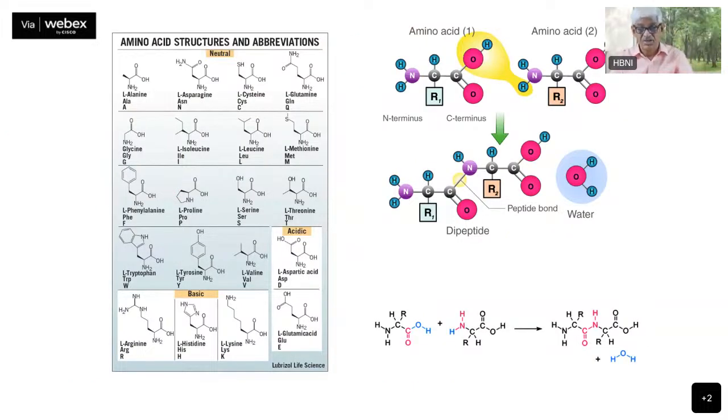Okay, so that is so much for these organic molecules. Maybe Ghosh will cover more of those later. So this is in the next class. I think we will take this to the next class. So this is amino acids and how to analyze amino acid spectra.